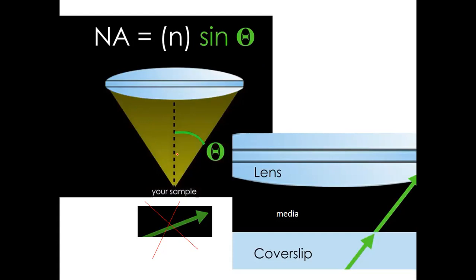Look at this. This is the light, and this is the numerical aperture, and this is how the light is going. See, if the light is going in this direction from the cover slip, it is not going to take up those rays. It just gets refracted. So actually the light is passing in this way, and this sine, whatever we have mentioned, is considered to be 1.